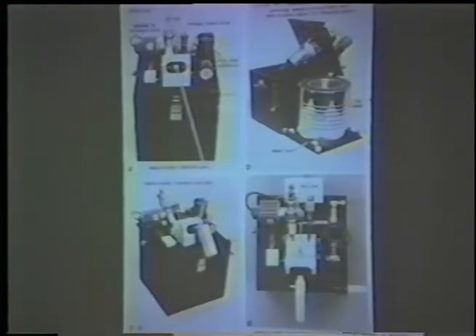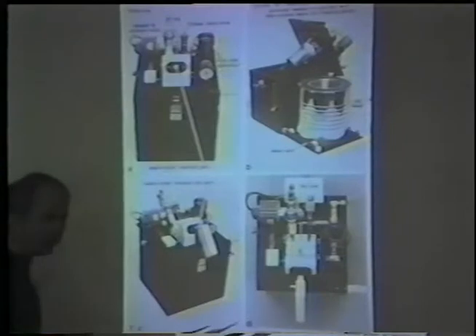In the RMC machine, the liquid nitrogen boil off when you're using propane comes up past the jets and then out. The jets are in those housings. That way you keep the jets at as low a temperature as you can so that the propane isn't warmed up as it comes through.